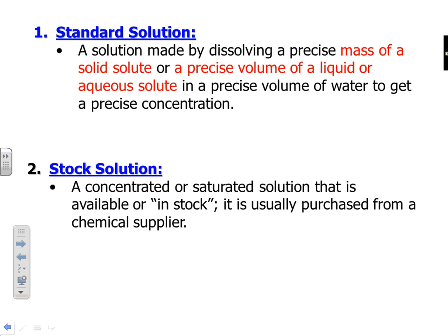So, making a solution of a well-known concentration is all about our measuring techniques. We will be using two pieces of equipment, essentially. One to determine the mass. Now, the scales that we use for the grade 9s and 10s weigh to 1 decimal place, all right? Which means we can only know the mass to 1/10 of a gram. The scales we use in grade 11 and 12 measure to 2 decimal places, all right?